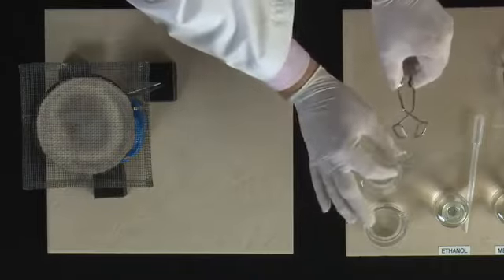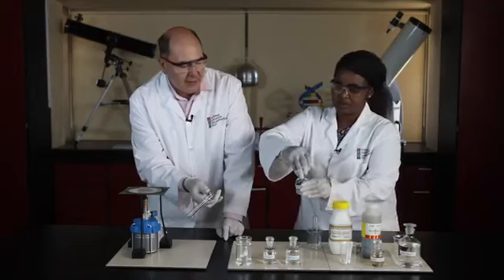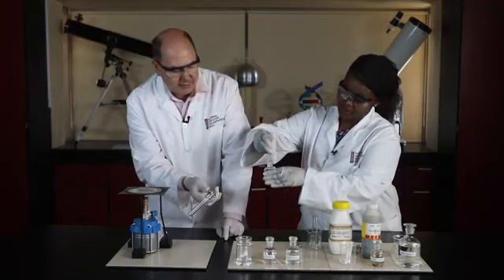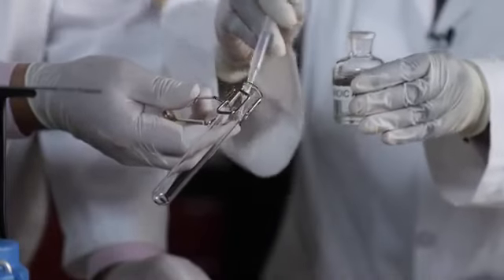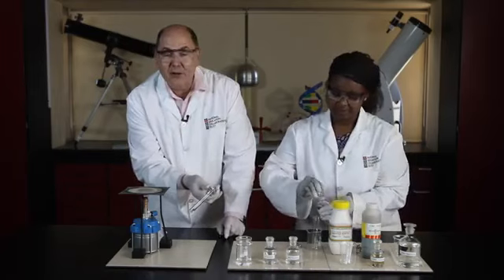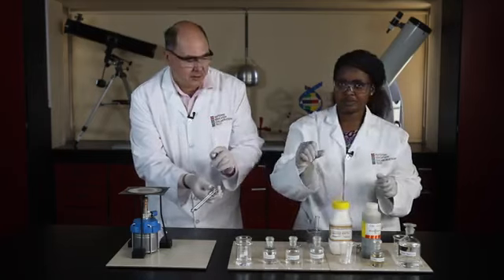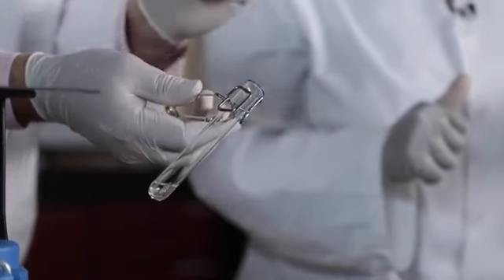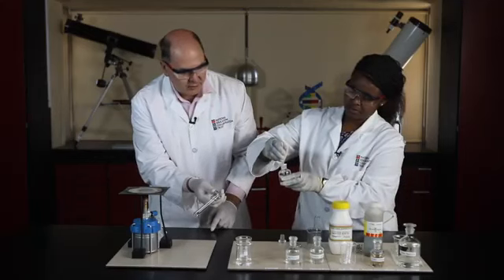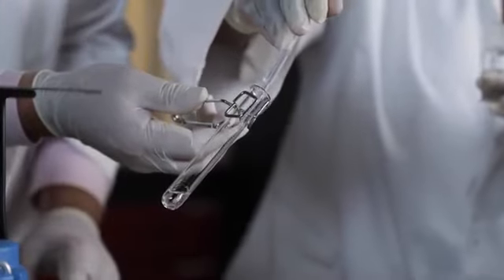Right, let's get our test tube ready. We're going to add 2 ml of ethanoic acid to this test tube. Thanks, Joyce, using the pipette. There we go, beautiful. Now, ethanoic acid smells just like vinegar. That's important to take note. Next, we're going to take 20 drops of ethanol. It's about 2 ml of the ethanol into the test tube, and away we go.